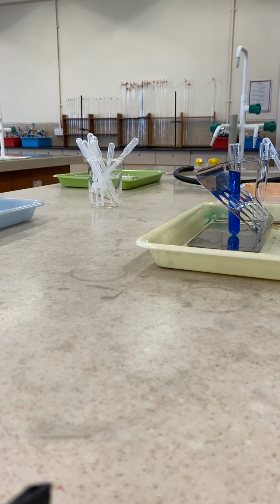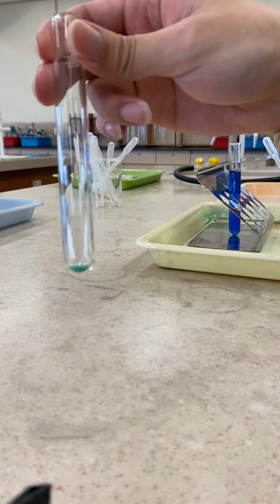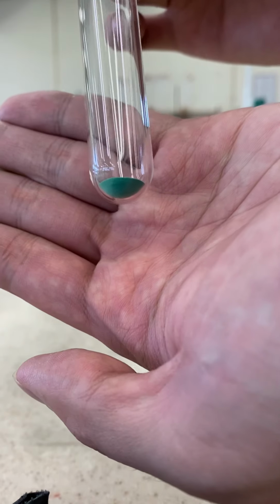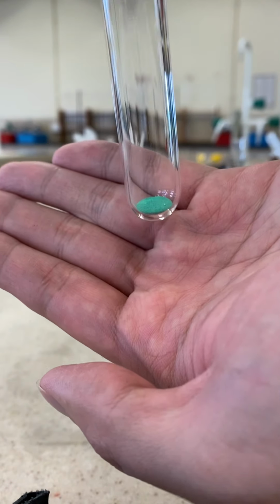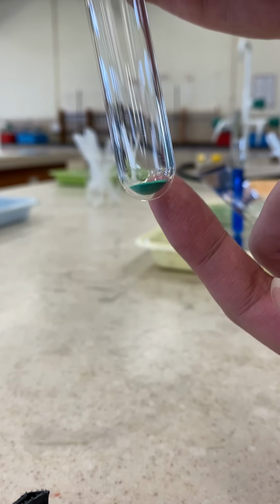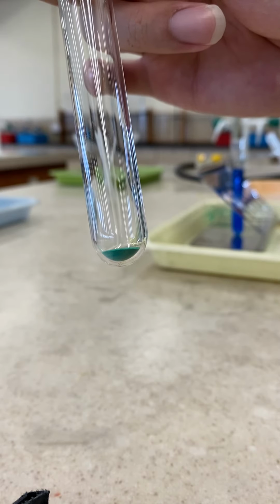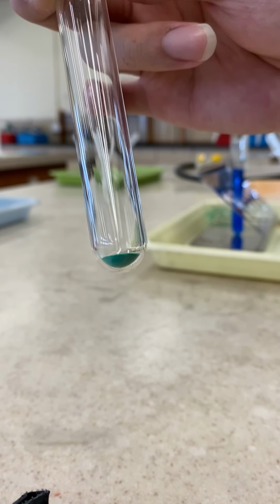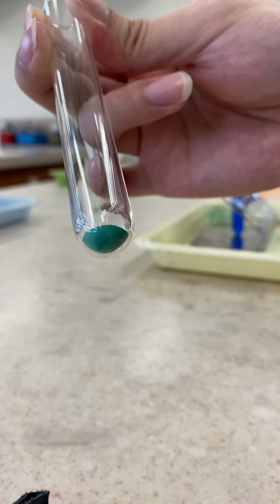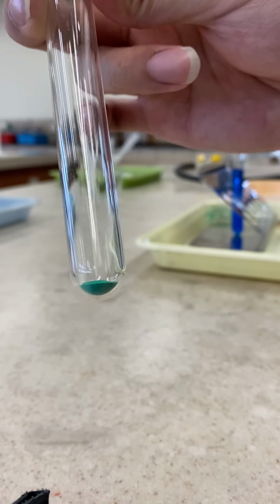The second part of the experiment is about this solid, copper-2 carbonate, a green solid. Again, when you're observing its color, it is green and it's a solid under room temperature and pressure. Any new substance formed? The answer is no, so the color and the physical state should be physical properties of copper-2 carbonate.